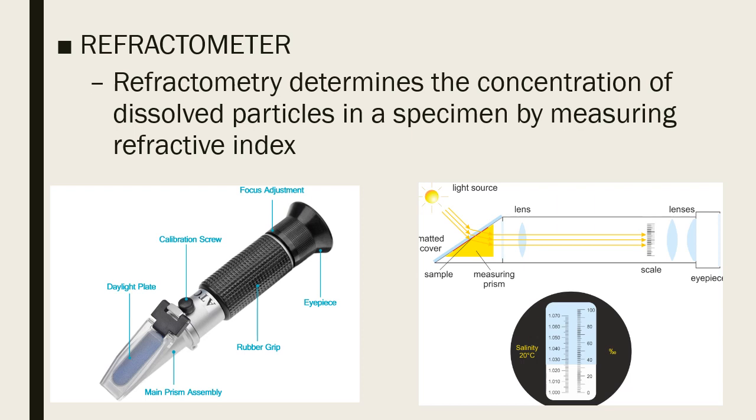And so your refractometer is calibrated at 1.000, using your distilled water.